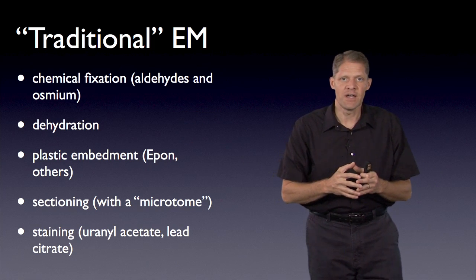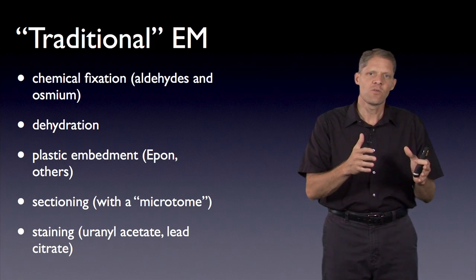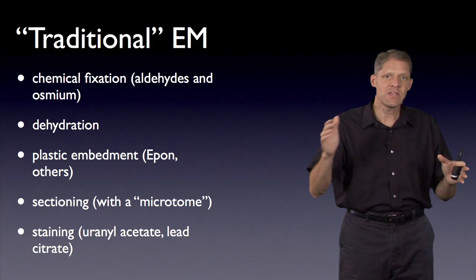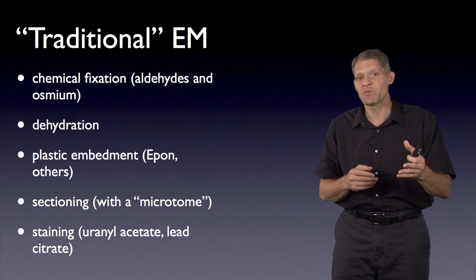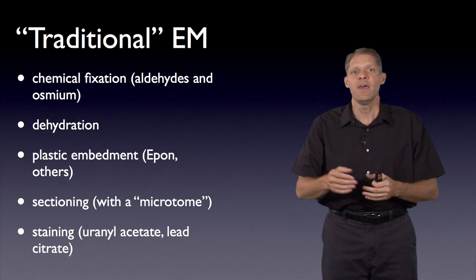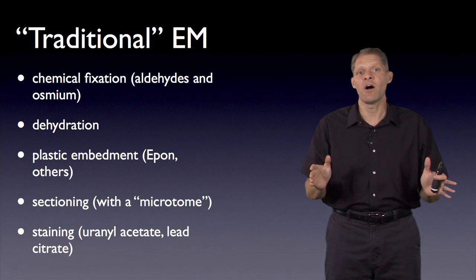Now, this is typically done by starting with the cell in probably an aqueous solution, washing it with a solution that may only be 90% water and say 10% alcohol. And then after that's completely washed through the sample, washing it again with a solution that's only 80% water and 20% alcohol. And then 70 and 30, eventually 50-50 water and alcohol. And then more alcohol than water until eventually the cells are bathed completely in some kind of alcohol or other organic solvent.